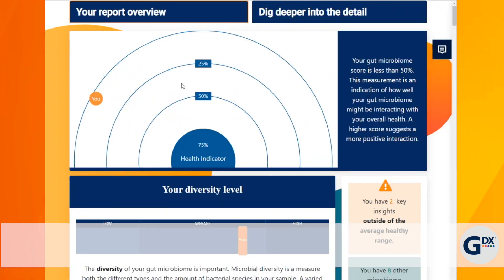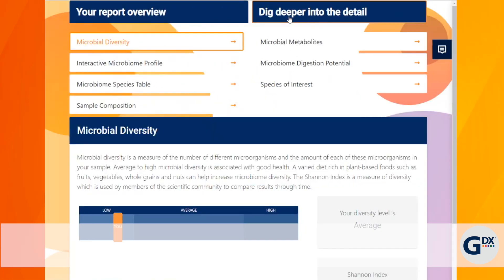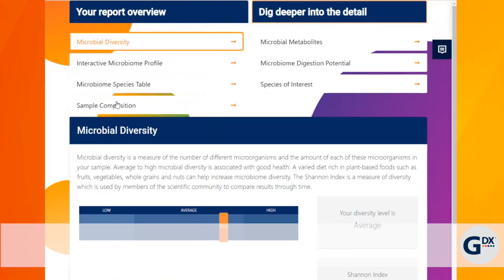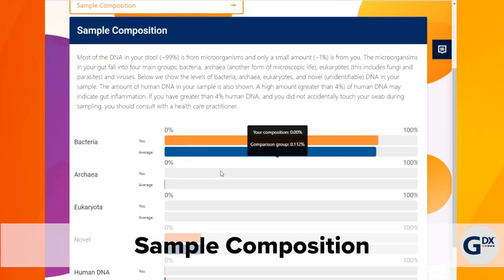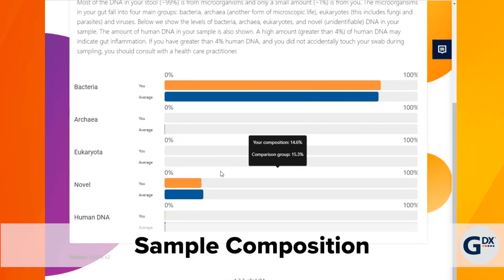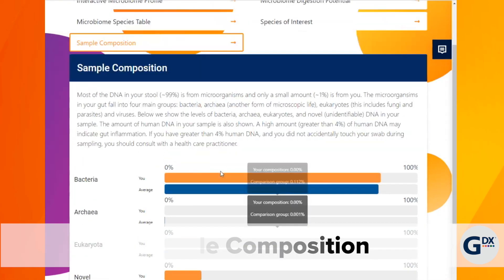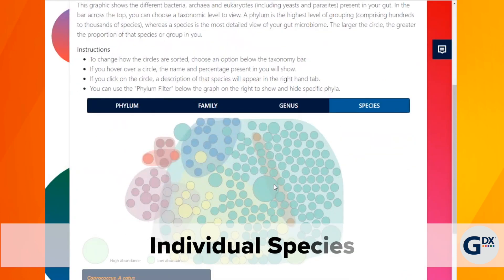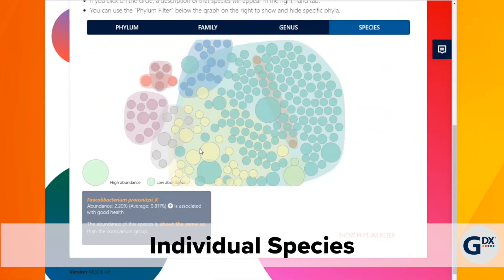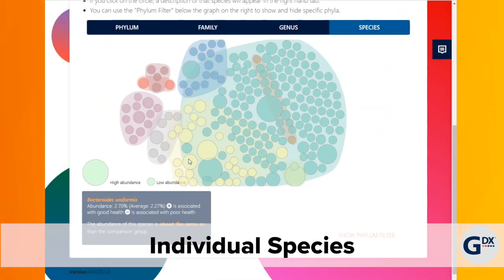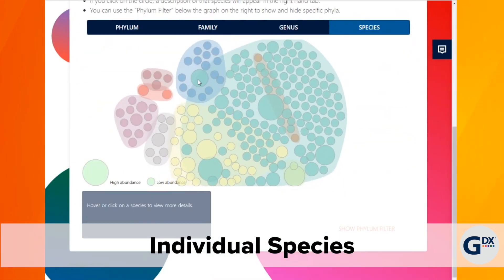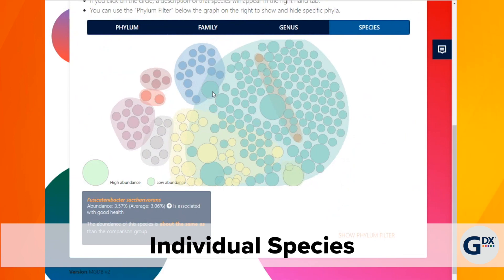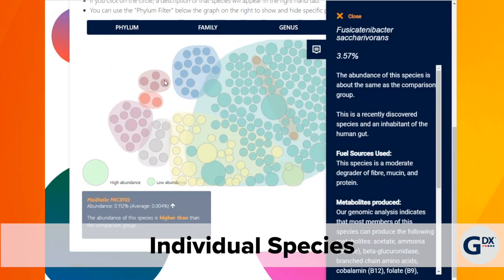For those who prefer to dig deeper into the details, you can gain insight into sample composition, or you can look at each species. Simply hover or click on any species to view more details.